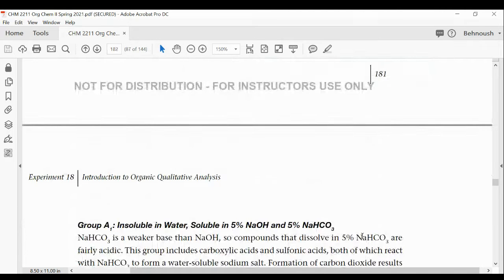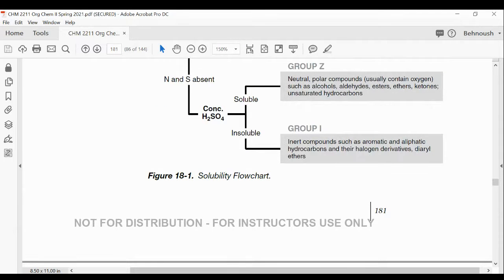So let me ask you a question. These are the type of questions that you could also see on the exam, and you have more types of questions in the video. And I'm sure when you watch the video, pay attention to the examples that I'm using also. Let's say you have a test tube, and in the test tube, you don't know if it is propanone or octanone. Which solubility test would you use to distinguish if your compound is propanone or octanone? What test do you think will work for you to find out if your unknown is propanone or octanone?